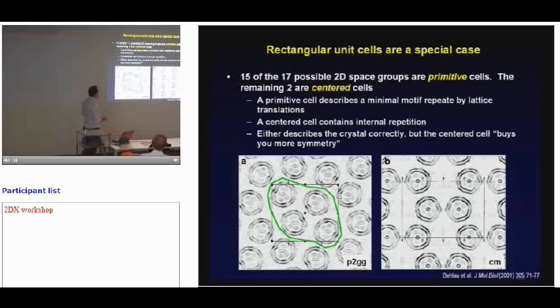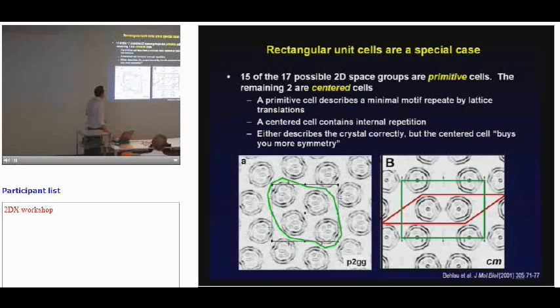However, the structure on the right-hand side over here, you can see that this minimum repeating unit is actually this dimeric arrangement of the porins. And so you can shift one up here, you can shift one here, you can shift one here and one here. And indeed, you can define a primitive cell which will do this. This is the primitive cell that defines this, and so we can move this way, we can move it back here, and we can move it to the side and reproduce that pattern, but there's no symmetry then in that pattern.